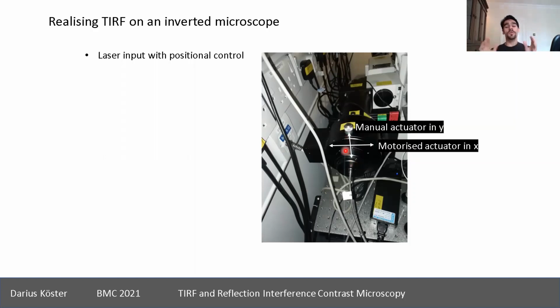Because what you normally do is you set up the angle, or the TIRF, in such a way that you only move one of the axes. You rarely move both axes. Yeah? You don't want to mix up your polarizations and your paths. So normally you just choose one plane in which you move the laser around. It's also a safety issue, so you normally don't want to have the laser moving towards you. Again, it's difficult to do it online. It would be much nicer to show it in real, but I hope you get the idea.